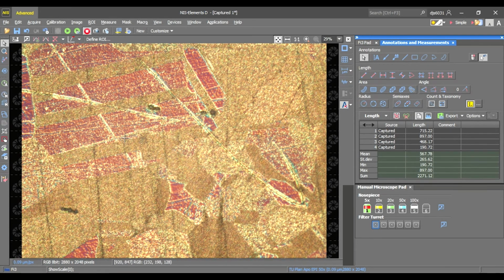When you're done with your session, all you have to do is close the NIS Elements and say okay. Usually at this point you can just close all. I like to save as I go along to make sure things are saved. You could wait until the end and then save them all at the end, but I get a little scared that I'm accidentally going to delete something that I want. So then by the end I can just click close all and it shuts down.